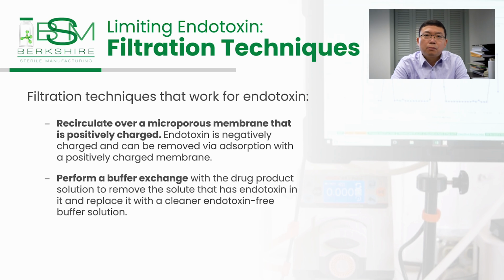We can also perform a buffer exchange with the drug product solution to remove the solute that has endotoxin in it and replace it with a cleaner, endotoxin-free buffer solution. However, this would only be helpful if the replacement solute is known to have a lower endotoxin level.